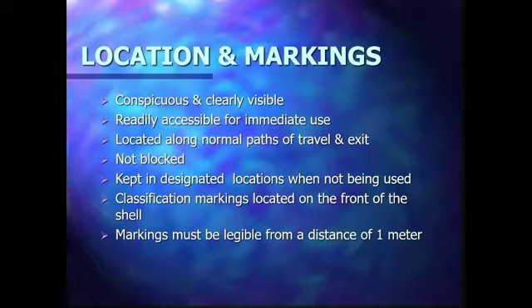You do not put ABC dry powder in a chemical, in a metal hazard or radiation kind of exposure. And you have to really identify what are the real hazards, especially in the labs. The lab, it is very important for you to identify the hazard, so that you should put the right fire extinguishers in the location.